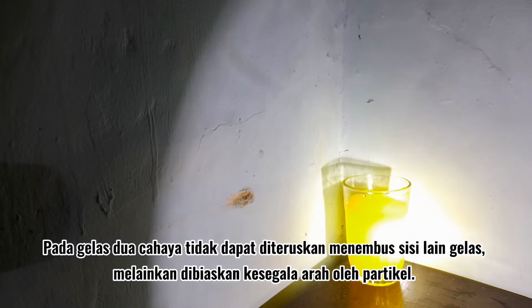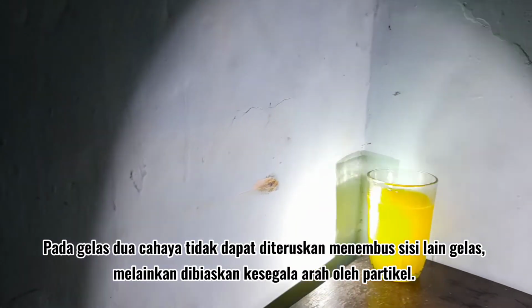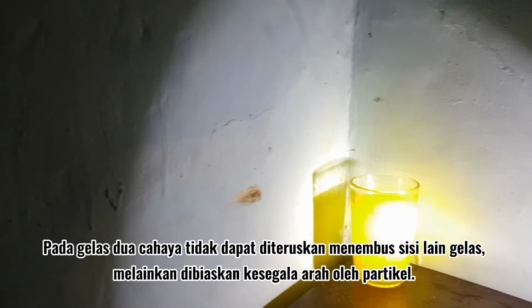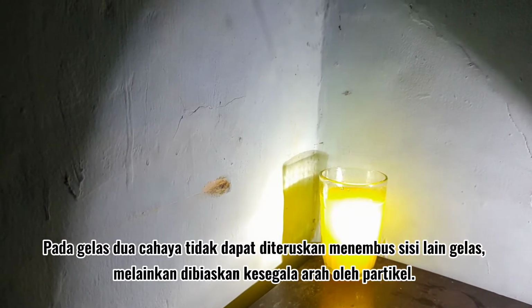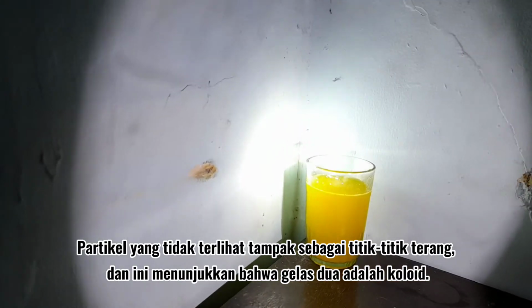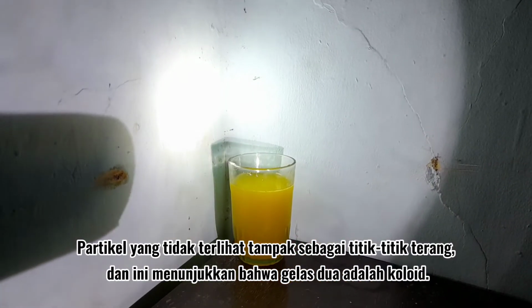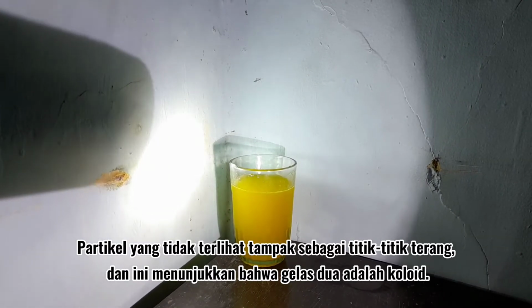In glass 2, light cannot pass through to the other side of the glass, but it is scattered in all directions by particles. Invisible particles appear as bright dots, and this indicates that glass 2 is a colloid.